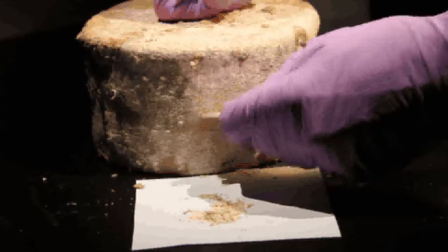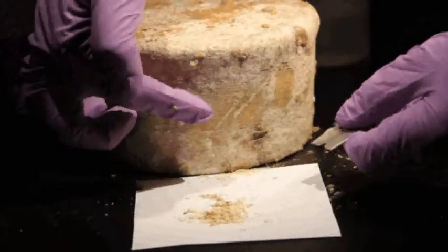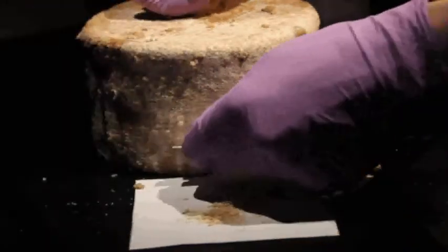I'm going to stop scraping this particular area of the cheese because, as you can see, this orange, dark, sort of brown color is starting to come through. That's the curd. We've hit the curd and no longer have much of a rind left.